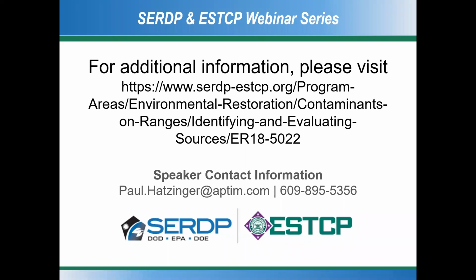Nitrate is fairly inexpensive through USGS. I think it's under $100 a sample. Perchlorate is fairly expensive, but that's mostly due to the amount of work it takes to purify the perchlorate from the field samples. It's collected on ion exchange resin. There's a large purification that happens. That's probably over $1,000 a sample for perchlorate.